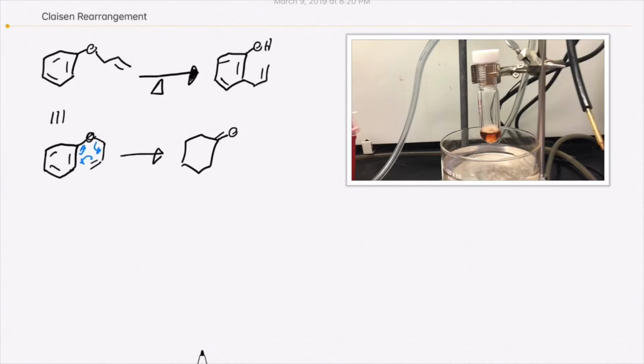Oxygen double bond now, with your newly formed alkene. But we know that there's going to be a tautomerization to reestablish aromaticity, so equilibrium is going to favor the aromatic phenol. This reaction happened at 190 degrees Celsius.